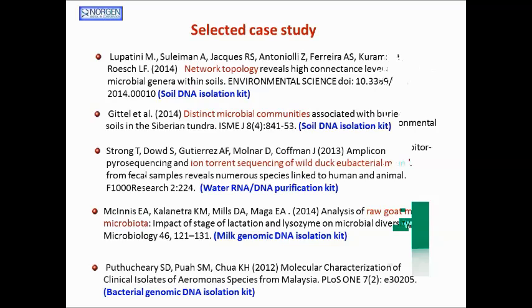So speaking of DNA isolation, there is no universal DNA isolation method available. Thus, it is important to find the right DNA isolation method. A good DNA extraction kit for the samples we mentioned should deliver at least a wide range of sample acceptability, including all the challenging environmental samples I just mentioned.